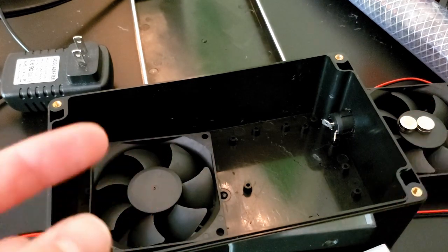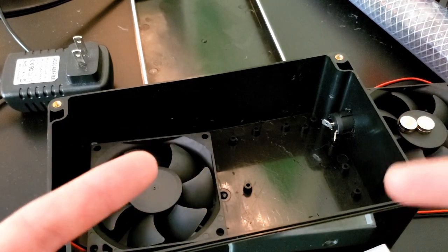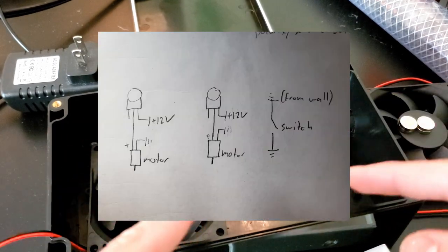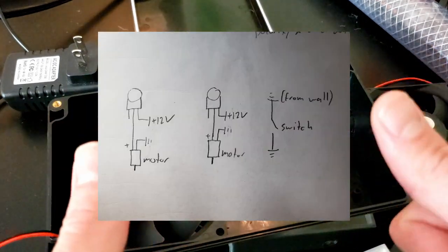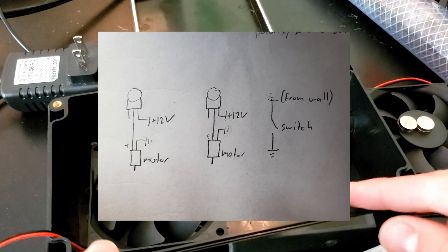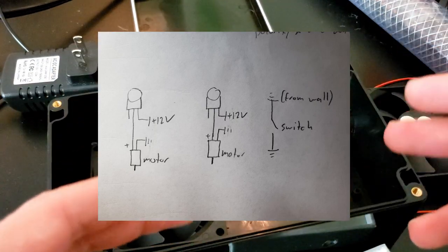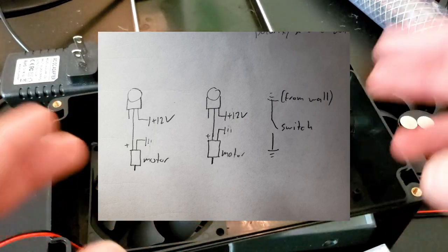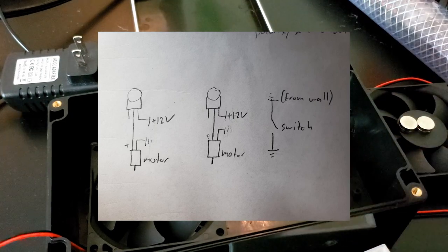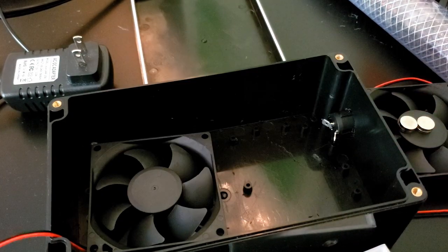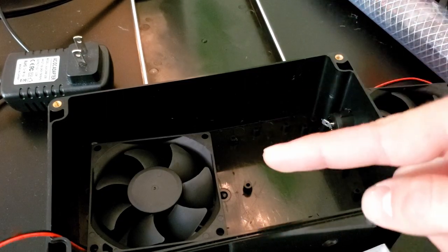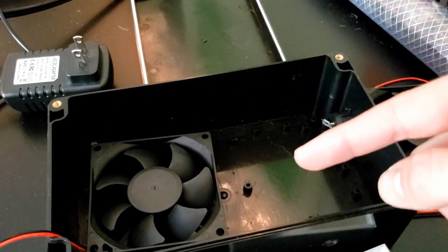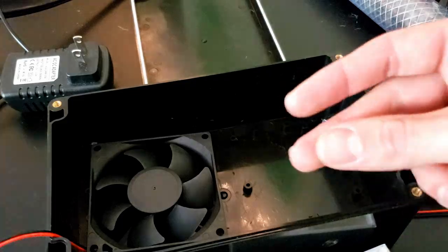So I will put the wiring diagram on the screen after I finish wiring it and make sure everything works well. Just so you can pause the video to look at the wiring diagram. You know, put it all together yourself if you want to. But now, I'm going to solder everything together.